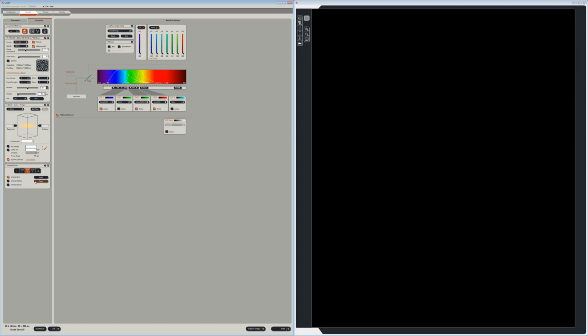Then I'm going to go to the second one, same, I'm going to disable these 2, and I'm going to turn on the laser power for this, and I'm going to leave it around 28. Now the third one, same thing. I'm going to disable these 2, and I'm going to turn on the laser power a little higher, 73. And I'm ready to go when it comes to my different fluorophores. You can add 1 more, and you can also add bright field, and I will show you how to do that in a different video.